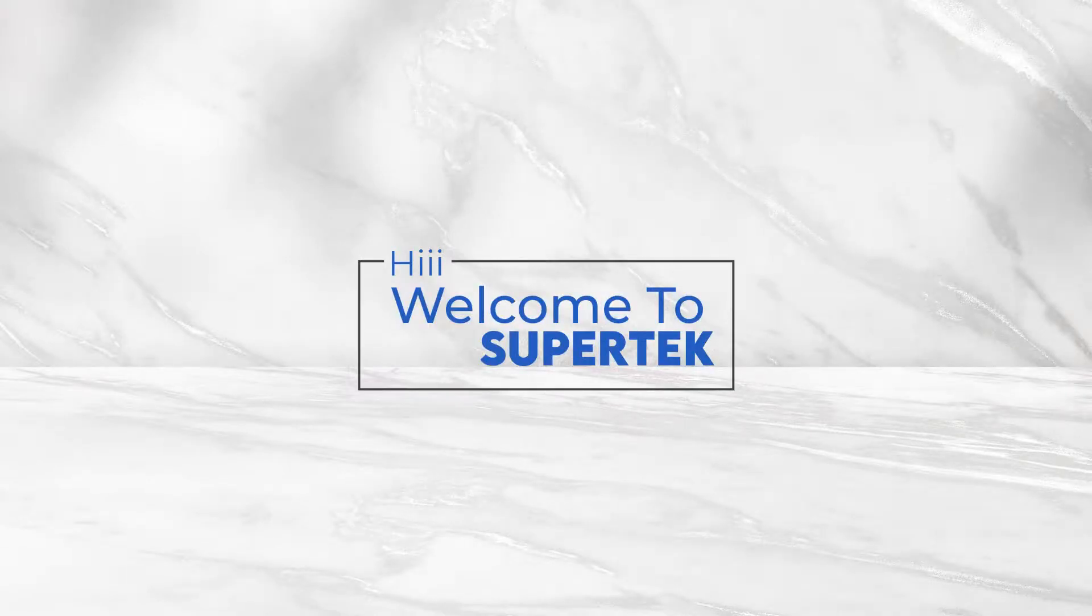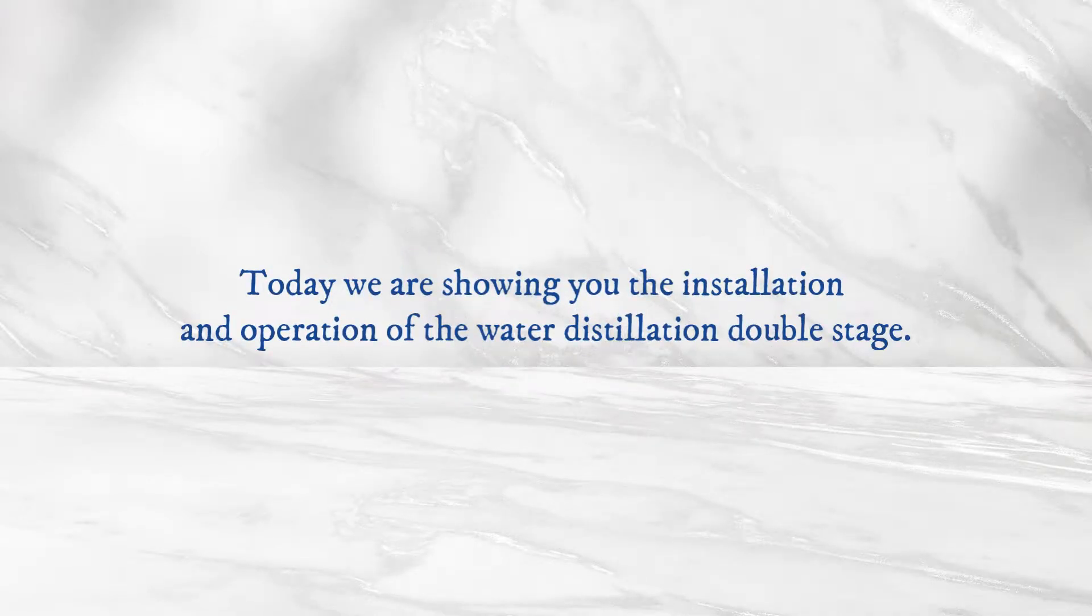Hi, welcome to Supertech. Today we are showing you the installation and operation of the water distillation double stage.